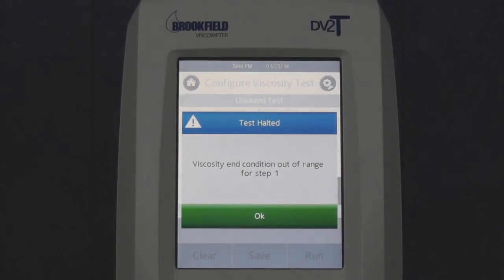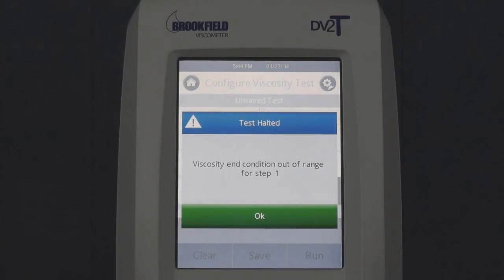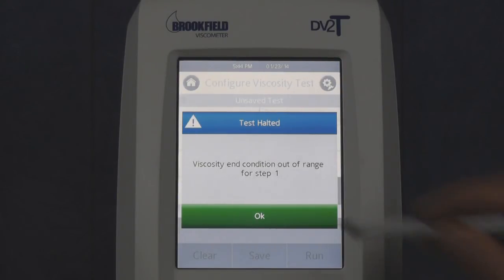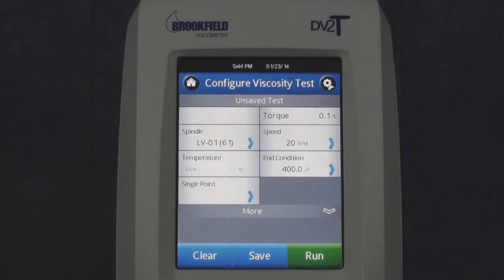If you choose a viscosity end condition greater than the range of the spindle and speed settings, a warning will be displayed when you try and start the test, indicating that the viscosity end condition entered is out of range. You must change the spindle, the speed, or both to be in the range of your viscosity end condition value.